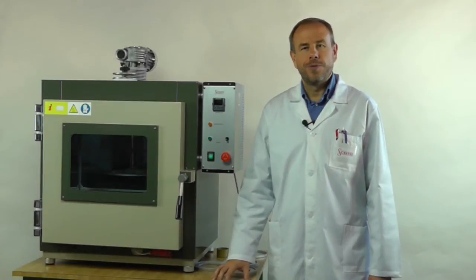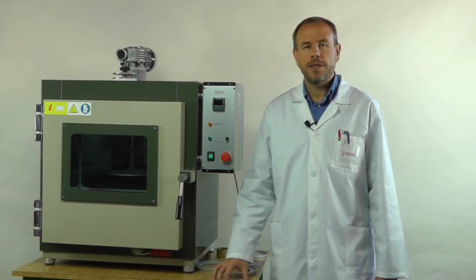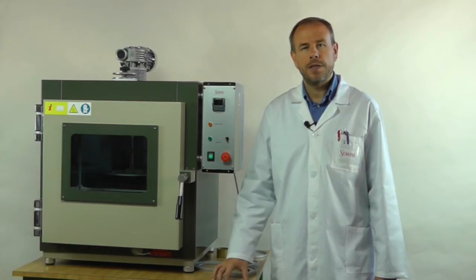Welcome to scavini.com on YouTube. I'm Roberto Scavini and I'm going to show you our equipment for the determination of loss and heating of oils and asphaltic compounds, according to ASTM D6.